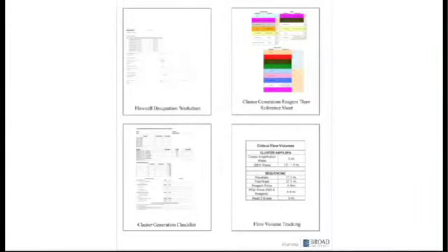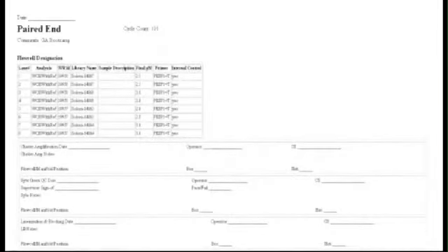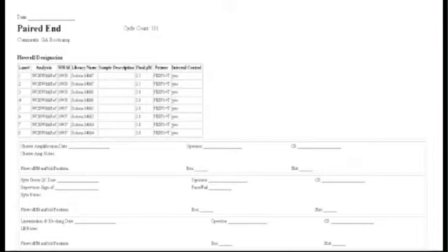We use several reference and tracking sheets throughout the process to help us maintain a standardized, high-quality, high-throughput system. The Flowcell Designation Worksheet is used to keep track of a flow cell as it goes through the cluster generation and sequencing process. The upper portion of the worksheet includes details like flow cell barcode, sample name, paired or single read, library loading concentration, and number of sequencing cycles.